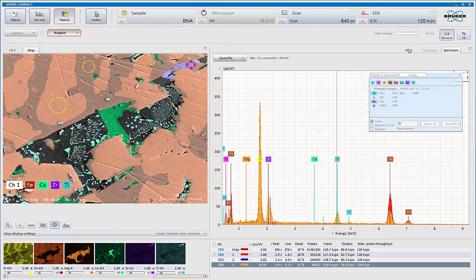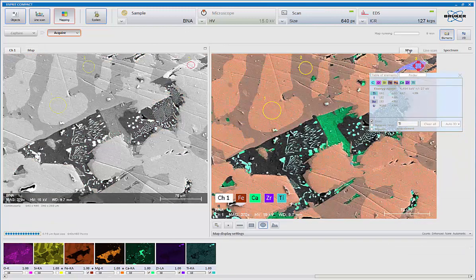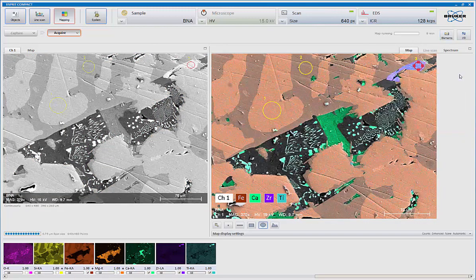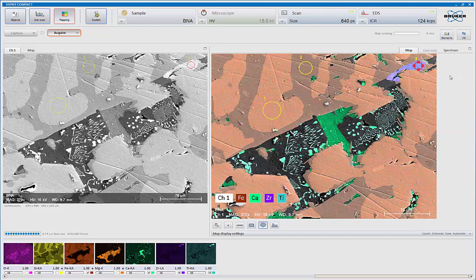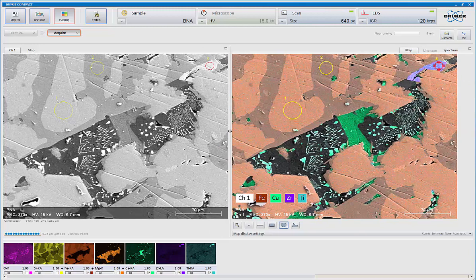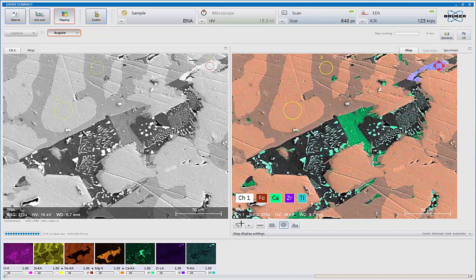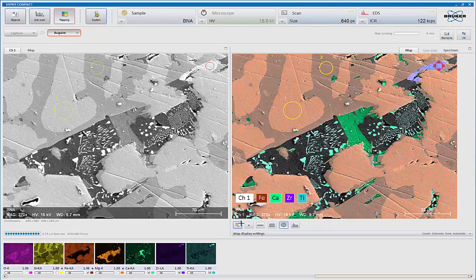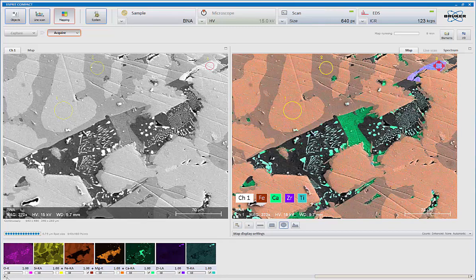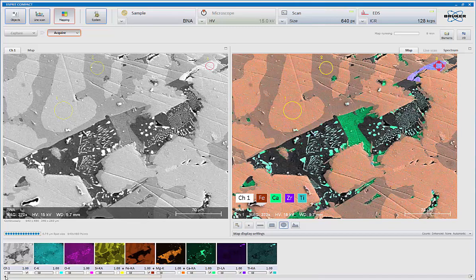Clicking on map over here, the system will automatically switch to the image on the left and bring the maps up. So in this one collection, I can bring up any element at any time. I can overlay as many of them as I wish, simply by clicking them on or off.